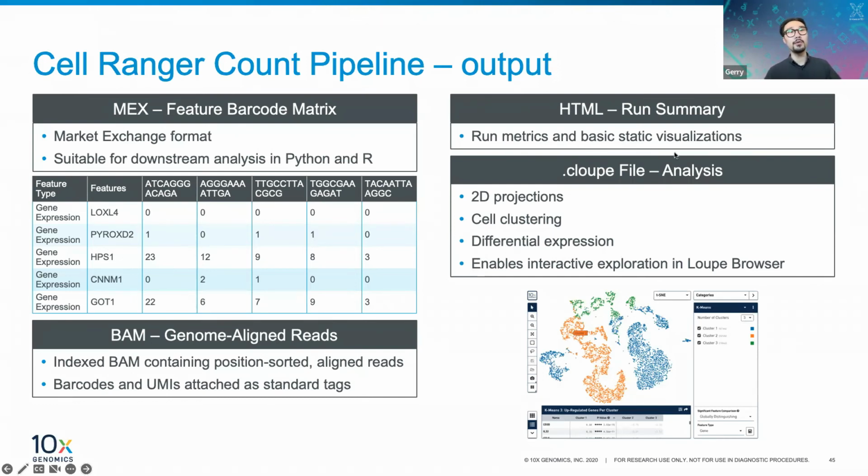This is what we will look at to assess the quality of your particular sample and run, and also what we will use to help you troubleshoot any issues that come up. It contains a lot of useful metrics that we can use to determine whether your sample quality was good, whether you had any kind of failures during your run, and how the sequencing went.